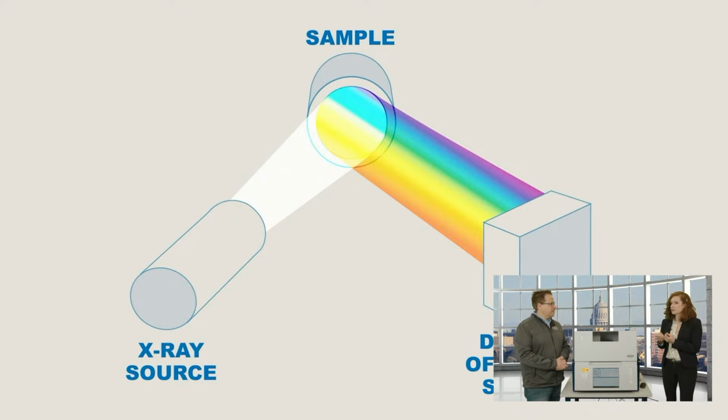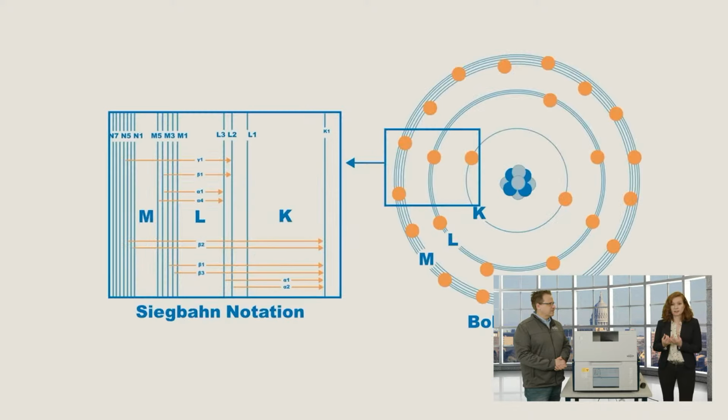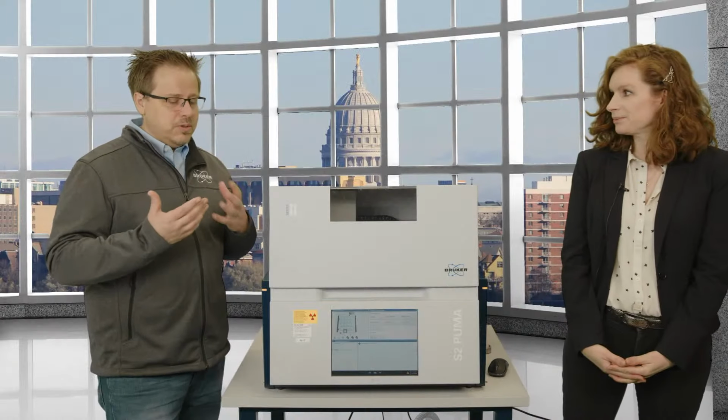And we wanted to make sure that people understand, on the atomic level, where the X-rays come from, and why they are called K alpha, K beta, M alpha, whatever. Because when you get an X-ray machine, you get all of these informations, and we want to make sure that we have something that people can watch and get a really cute, fun overlook.